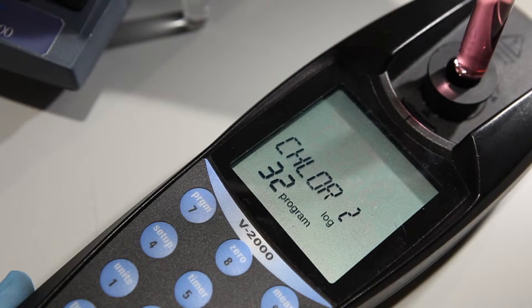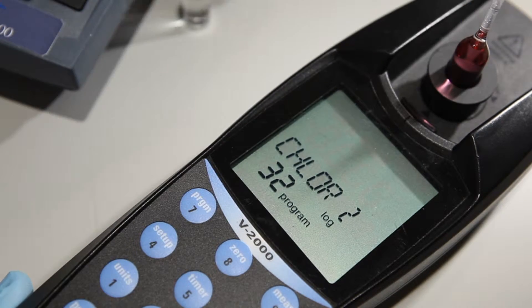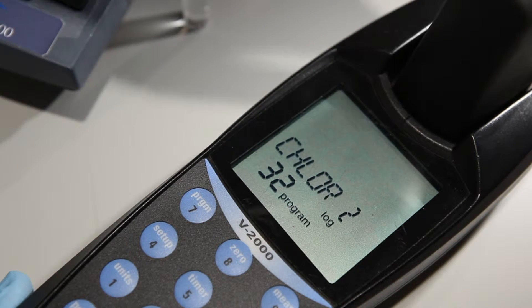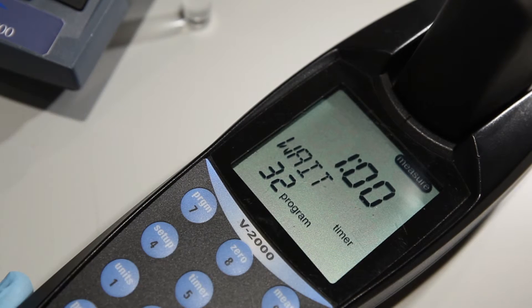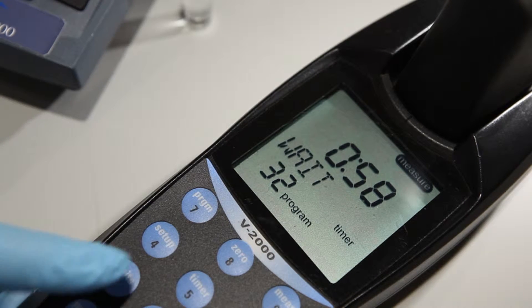Insert the Vacuvial ampule into the photometer, flat end first, and cover the test vial with the shield. Press the measure or start enter key to obtain results in parts per million.